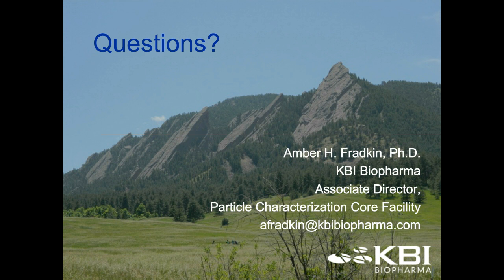That's a tough range because you're kind of on the border of a lot of the limits of detection for different techniques. Certainly for solutions, I start with MFI that can help you understand the concentration and can help you start to classify some of those particles, between 5 and 10 micron. But then I generally suggest bridging that data between 1 and 10.